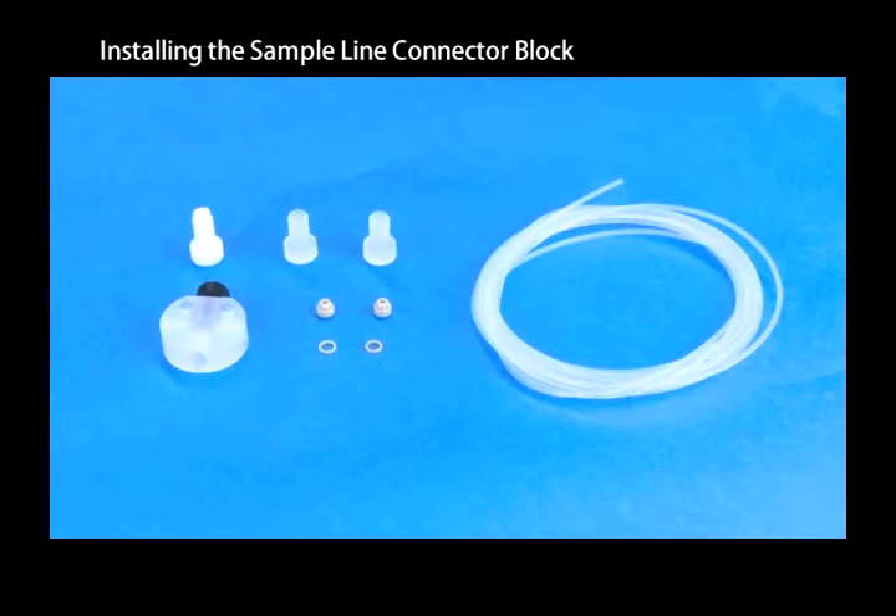The sample line connector block grounds the sample introduction tubing, eliminating any buildup of electrostatic charge that could lead to signal instability. We will now demonstrate how to assemble the sample line connector block.